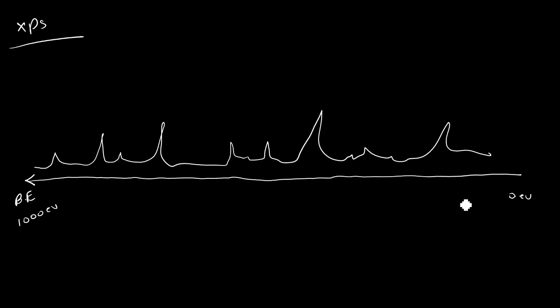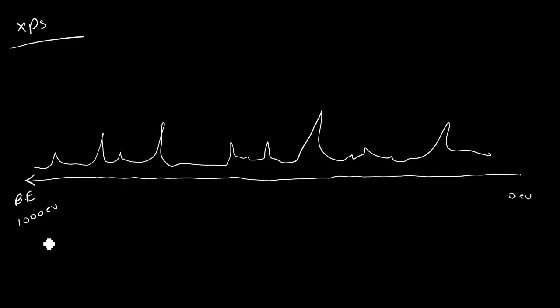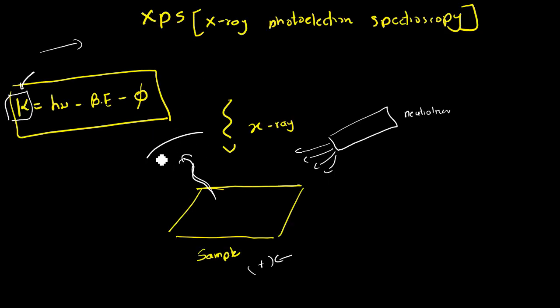Now a small thing you need to remember is that when these electrons are emitting from the samples, our instrument will catch them and calculate the kinetic energy, right? Based on this kinetic energy, it will determine the binding energy, and give you the binding energy for the spectrum. The important thing is the instrument reads the kinetic energy, not the binding energy. It reads the kinetic energy and changes it into the binding energy based on a calculation process.